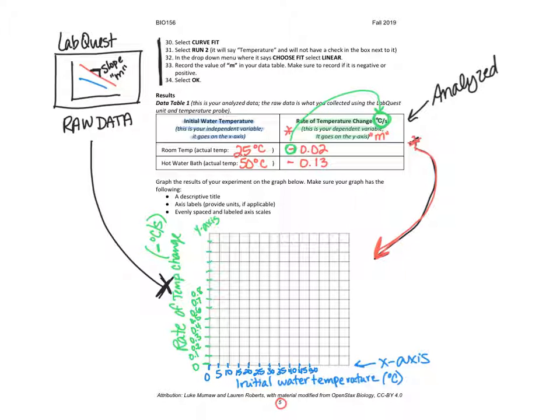Oh, and you know what? I just caught that I made a mistake here, because these are supposed to be 0.01 and 0.02. So let me actually fix that. Sorry about that. All right, so 0.01, 0.02, 0.03, 0.04, 0.05, so 6, 7, 8, 9. So that one's going to make this one up here 0.1.